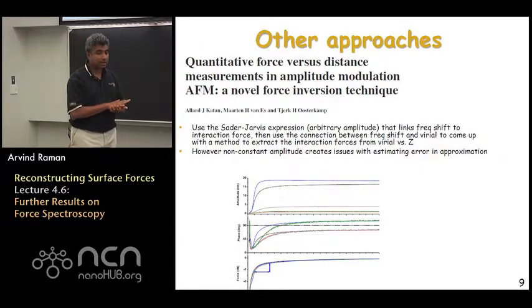However, there is a challenge that is mentioned in this paper, which is the fact that the Sader-Jarvis formula, specifically the interpolation term in the middle of the integral, does require, or its accuracy is certified in the situation where the amplitude of the oscillation is kept constant as you approach the sample, strictly speaking.